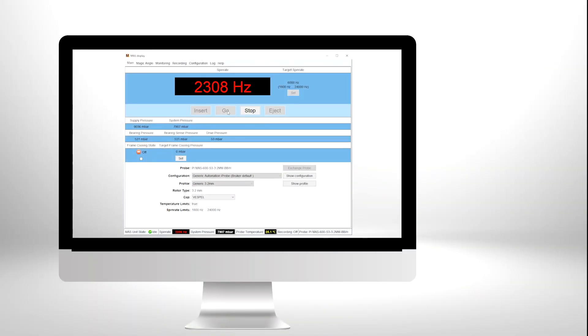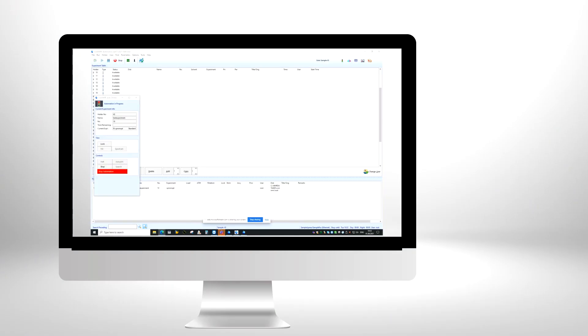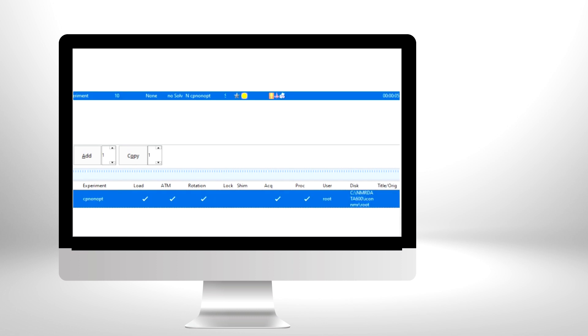The software takes full control of running your experiment, from selecting the sample to coordinating the insertion, getting the rotor up to spin speed, and returning it safely back into its original position.